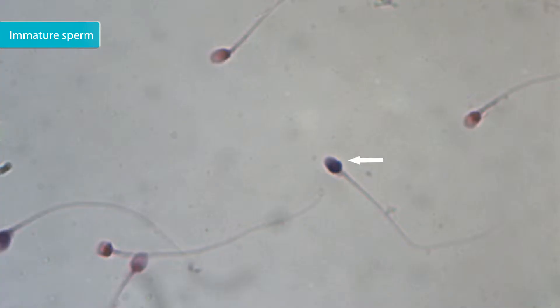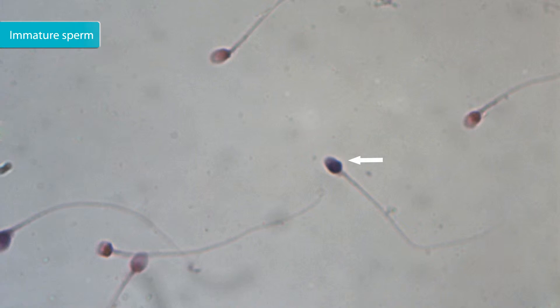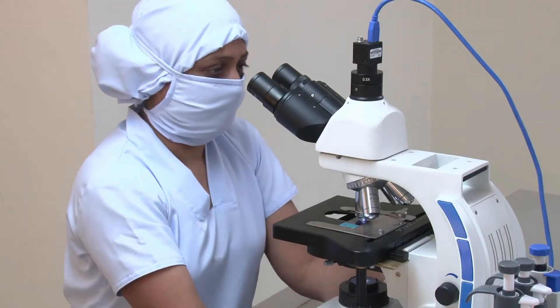Sperm heads with blue stain represent sperm with immature nucleoprotein. Sperm heads with red stain represent sperm with mature nucleoprotein. Calculate the percentage of sperm with immature nucleoprotein.